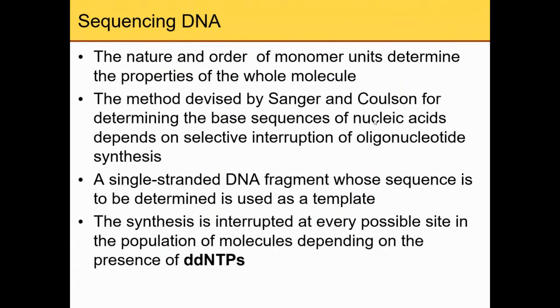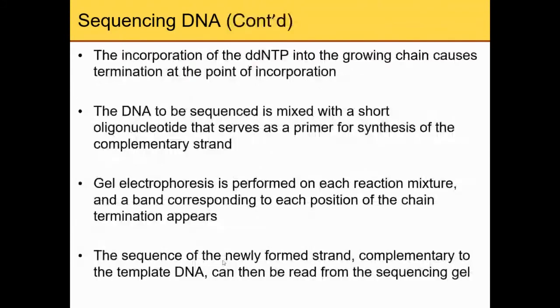The sequencing. Basically, you use a single-stranded DNA fragment as a template, and then synthesize a new DNA strand. In the meantime, you incorporate a specific nucleotide called a dideoxynucleotide. All right. And then by looking at the different lengths of the fragments, you can determine the DNA sequence. And this is the so-called Sanger sequencing, because the dideoxy DNA nucleotide is used.